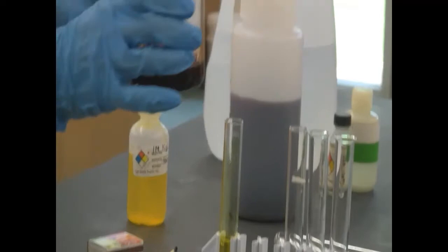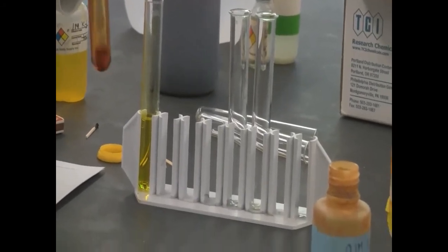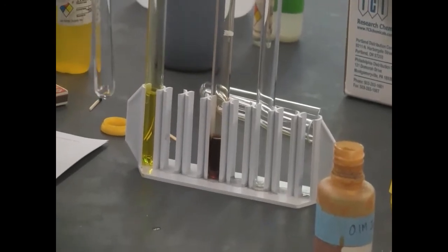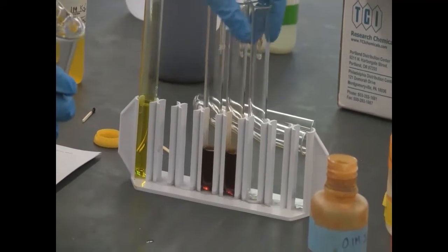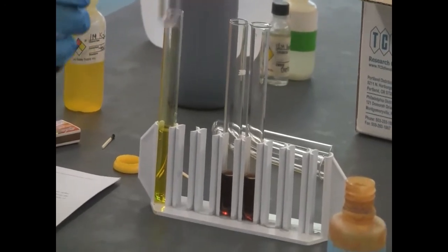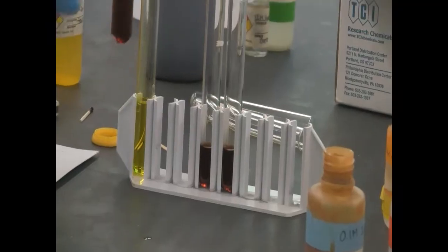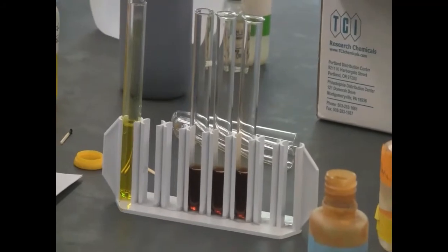Okay, so I'm going to pour this into 3 test tubes, separate them. Okay, first one, second one. The third one is going to be our control. So this one will be like this. Then the other 2, I will add something to shift the equilibrium. Then we can check the change by comparing to this control. So this will be our control number 3.